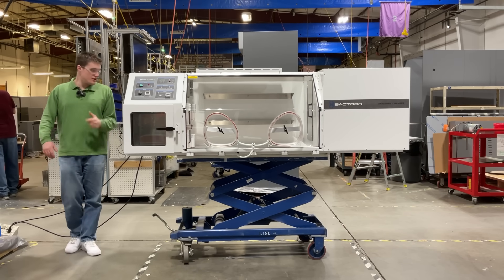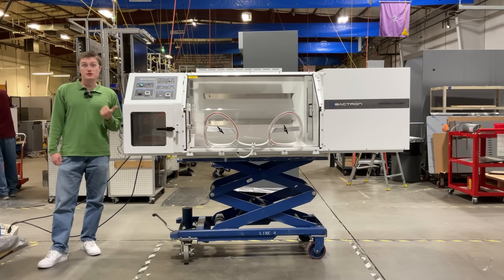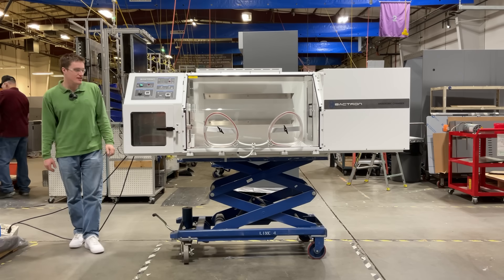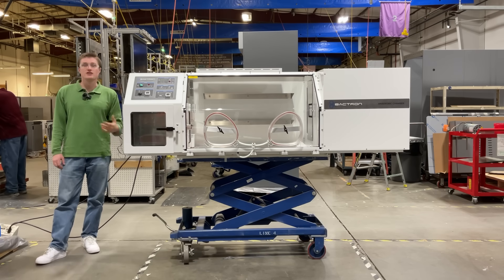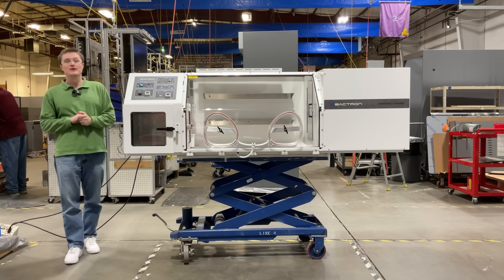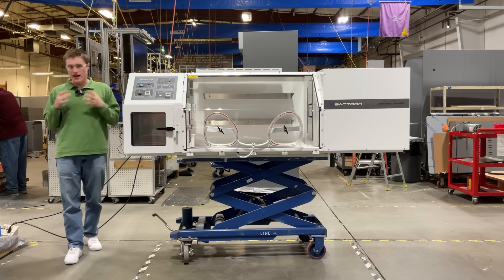Whether you're conducting clinical research, pharmaceutical testing, food safety testing, or industrial microbiology, investing in the Bactron 600 anaerobic chamber from Sheldon Manufacturing is a strategic decision that enhances laboratory efficiency, accuracy, and workflow.